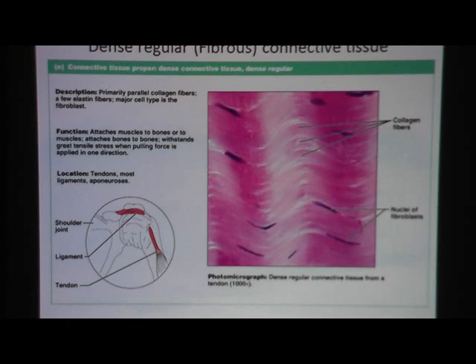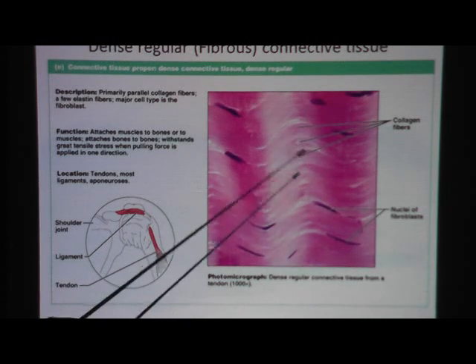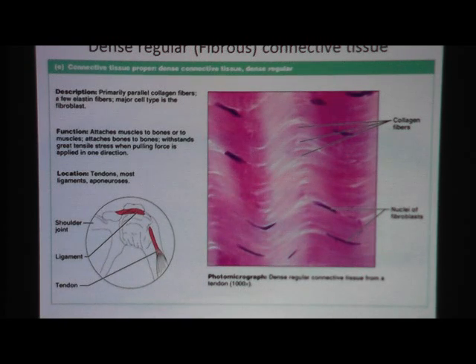Now when something is regular, it's organized. And so the name dense regular is this picture right here. Lots of fibers, lots of stuff, very little white spaces in between of nothing. And it's very organized, so it's dense regular. Where are we in the body? We're in the tendons and ligaments. Tendons and ligaments are very strong because these collagen fibers are very strong.